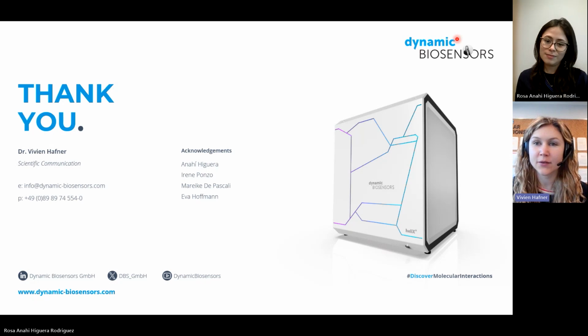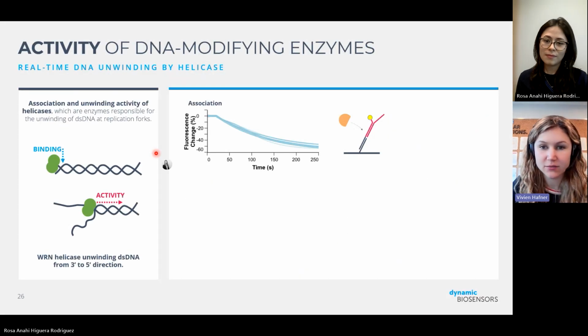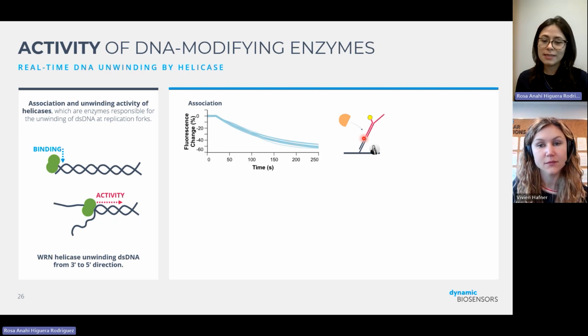Mm-hmm. And I think the nanolever also already has a minimum length, so to say. We already have the anchor strand, so it will already have a specific distance from the chip. So I think minimum length is also not a problem because we already have the standard part of the nanolever, right? So this standard part is 96 nucleotides. So this is already the minimal length from the chip surface.